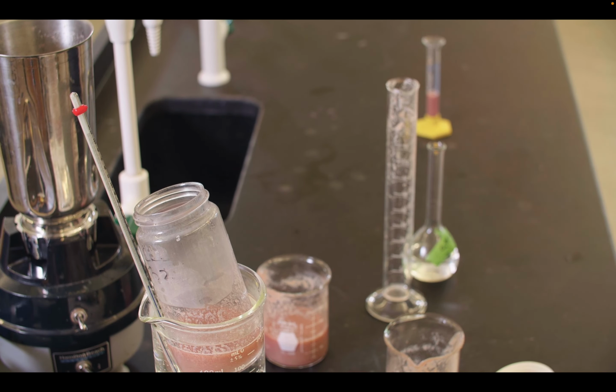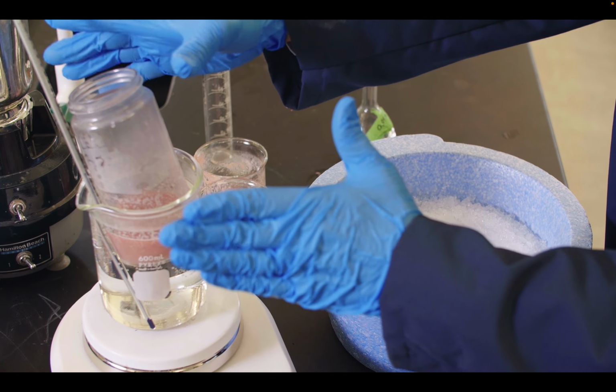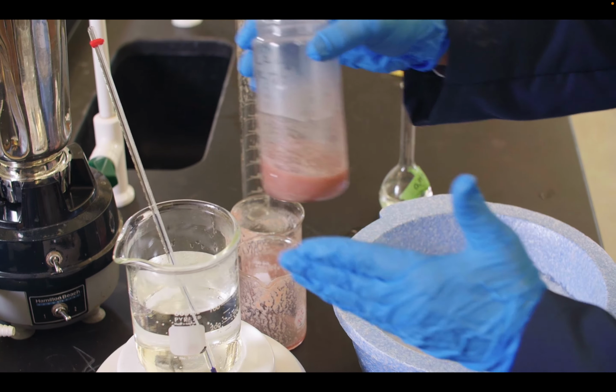Actually, 75 is the maximum, but 72, and we're going to heat this for 20 minutes. So it's been 20 minutes. We don't want to go more than 20 minutes, and we don't want to go higher than 75 degrees, so we've had it at between 70 and 72 the whole time.